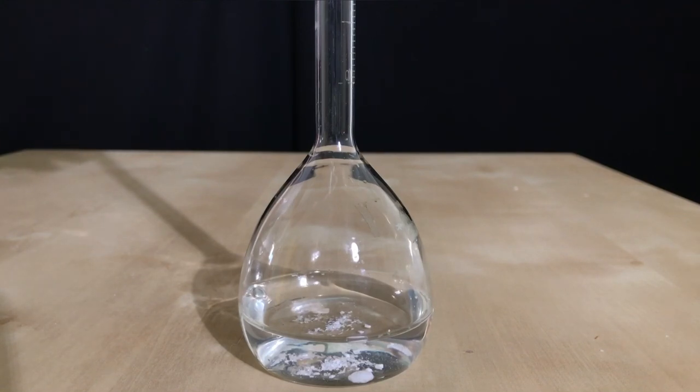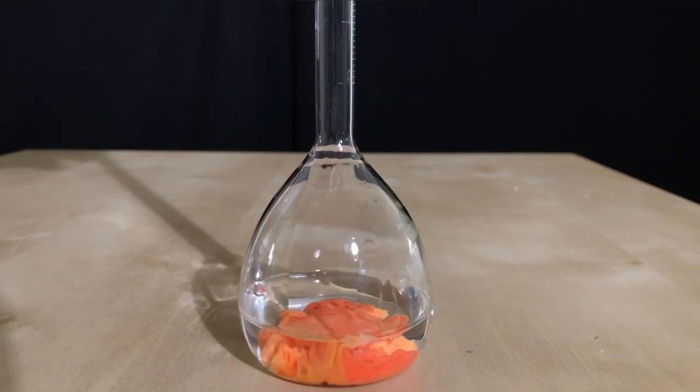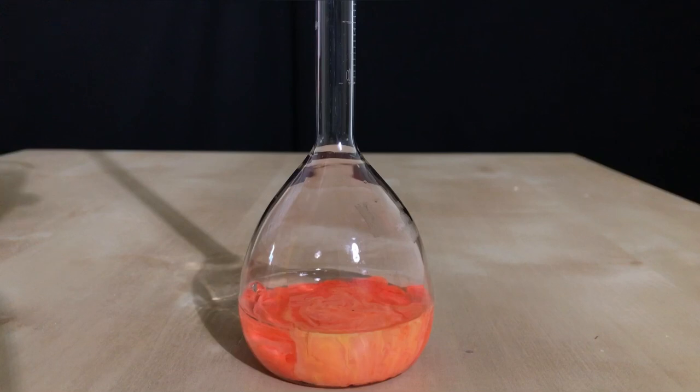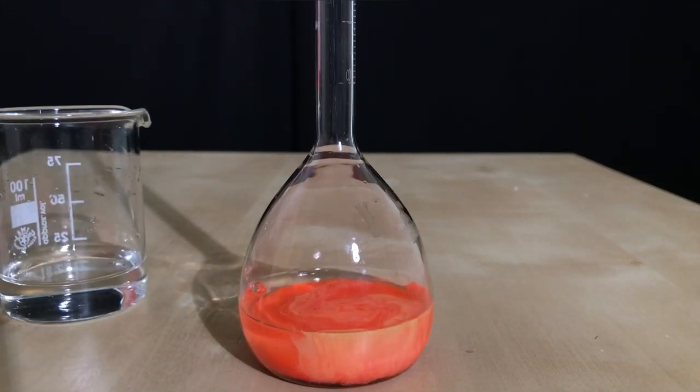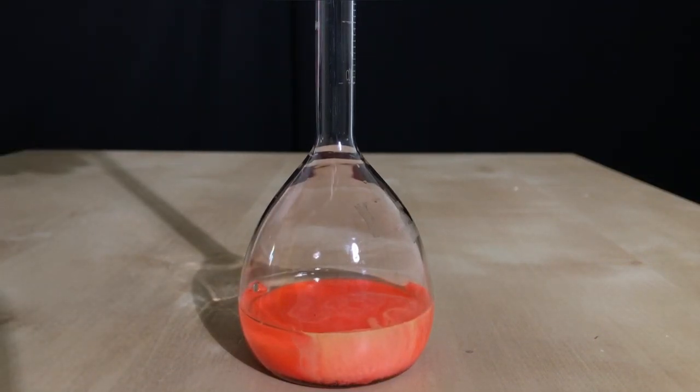Let's get to the fun part. Potassium iodide solution is added to mercuric chloride. As you can see this red precipitate immediately crashes out. This is mercury iodide.